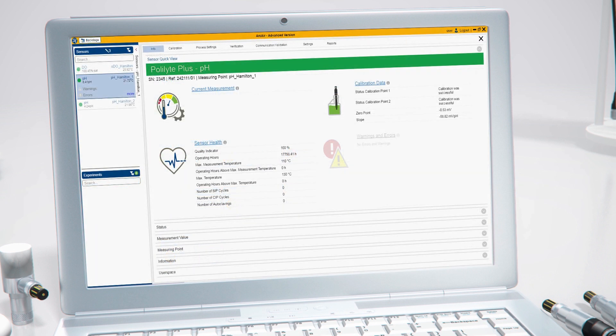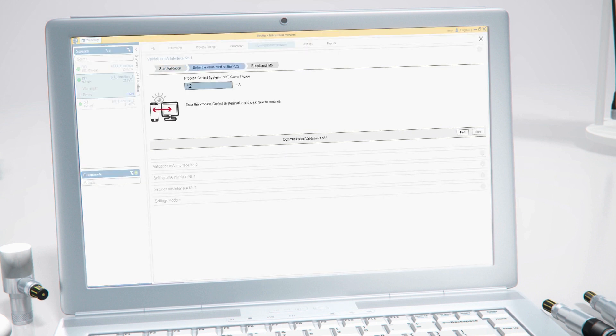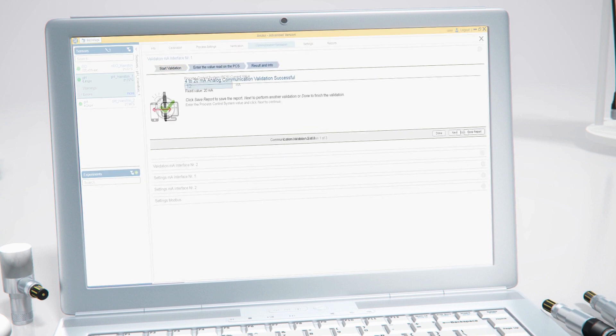ArcAir provides a robust connection directly to the process control system. In order to test the communication to the control system and to document it, you can easily verify the signal with the help of a wizard.